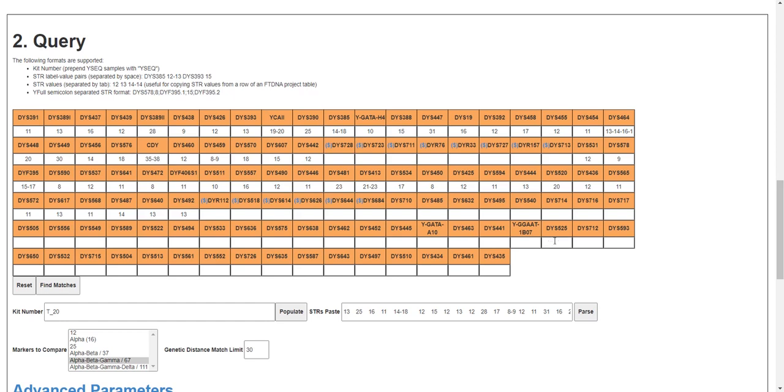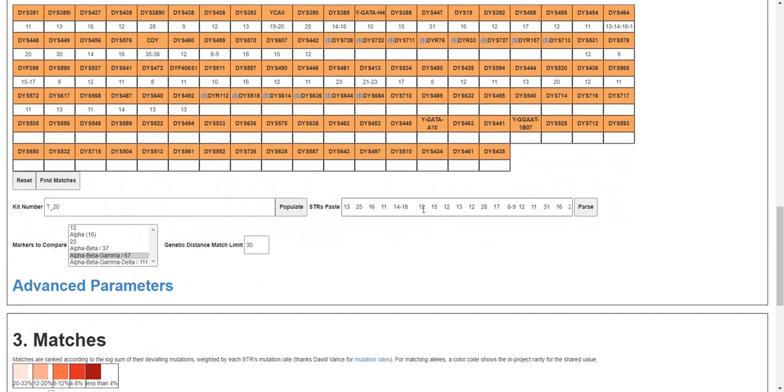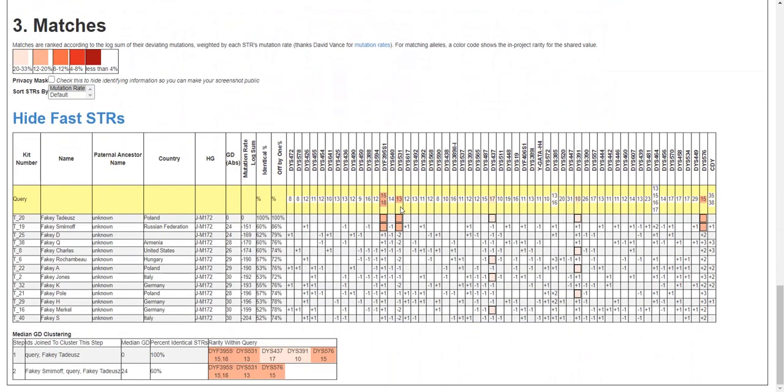But if you're a YSeq customer, you don't need to do any of that. Your STRs are already loaded in. Okay, I hope you're able to use this tool to advance your haplogroup research.